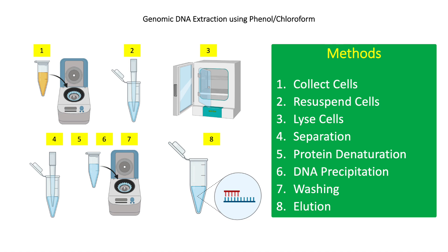For step four, add 700 microliters of phenol-chloroform-isoamyl alcohol and mix well by inverting the tube. This will separate the lipids and cellular debris containing proteins into the organic phase (the bottom part of the solution) and the DNA into the upper aqueous phase. Centrifuge at 13,000 RPM for 10 minutes. Pipette the aqueous phase and transfer into a fresh tube. Repeat step four twice.